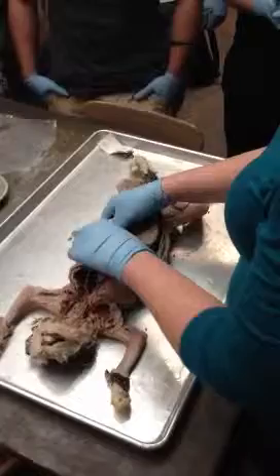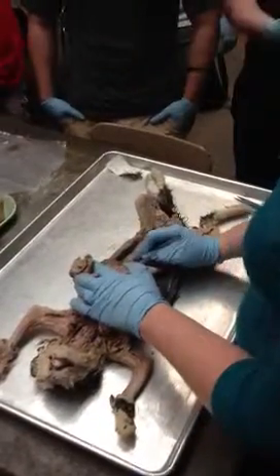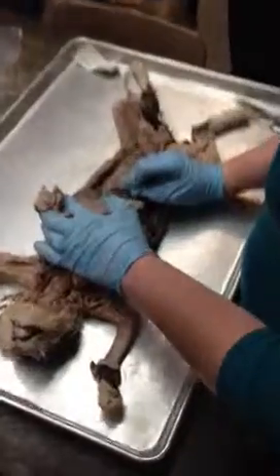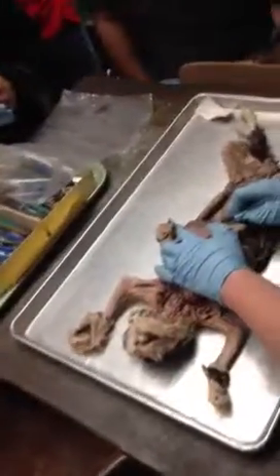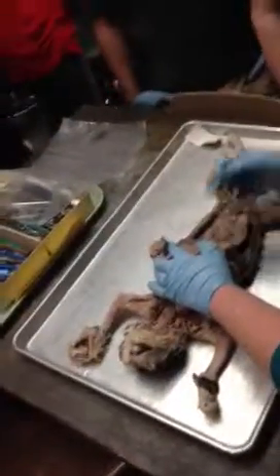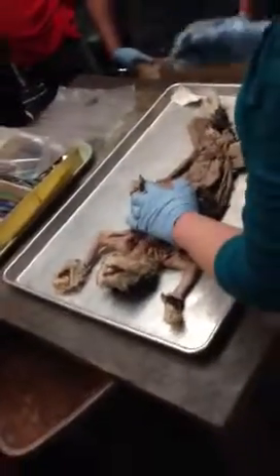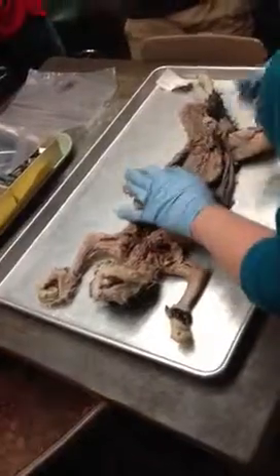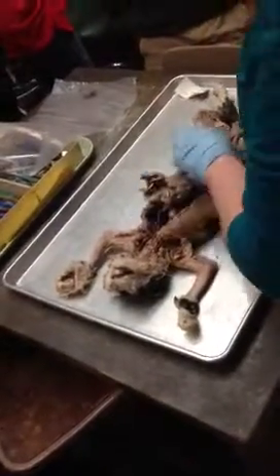Okay? Your adrenal glands sit on top here. So if you look, everyone wants to take a peek. You can see the kidney stops here, and there's this little triangle of glandular tissue above the forceps. That is your adrenal gland. Okay, just like in the humans. Typically, it gets removed in the cat when you move away the fat. So just be careful when you're clearing out that upper portion of the kidney. Okay. You also should be able to identify where the renal artery and vein enter and exit at the hilus.